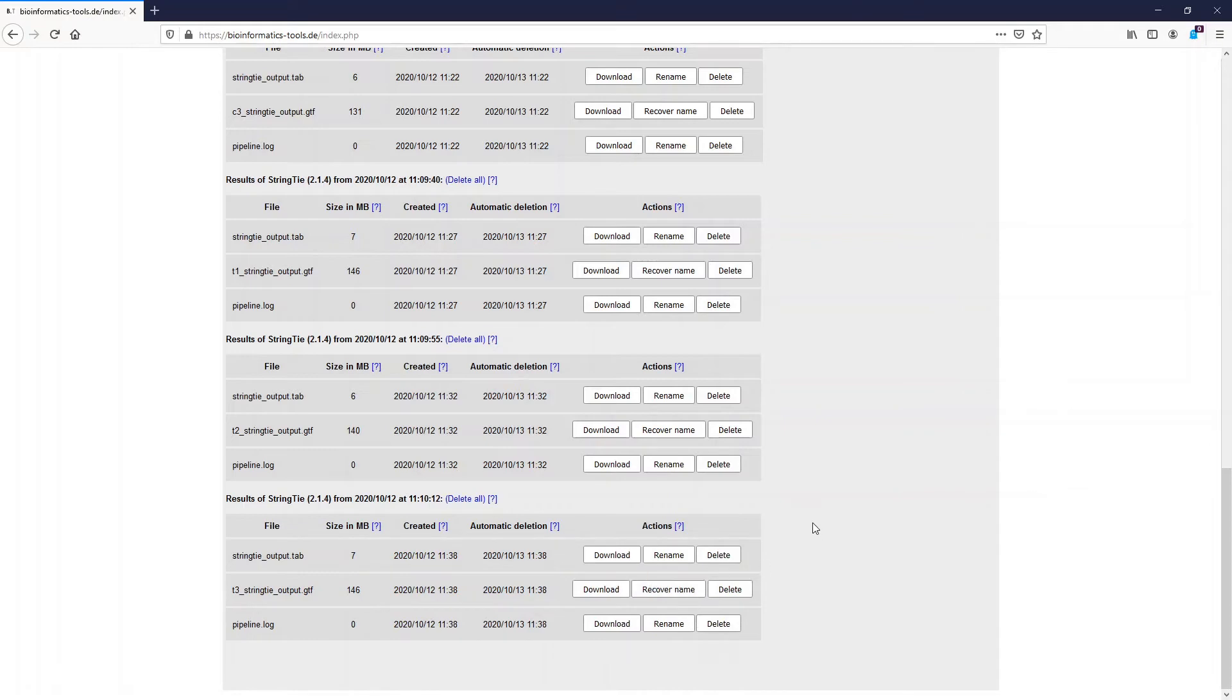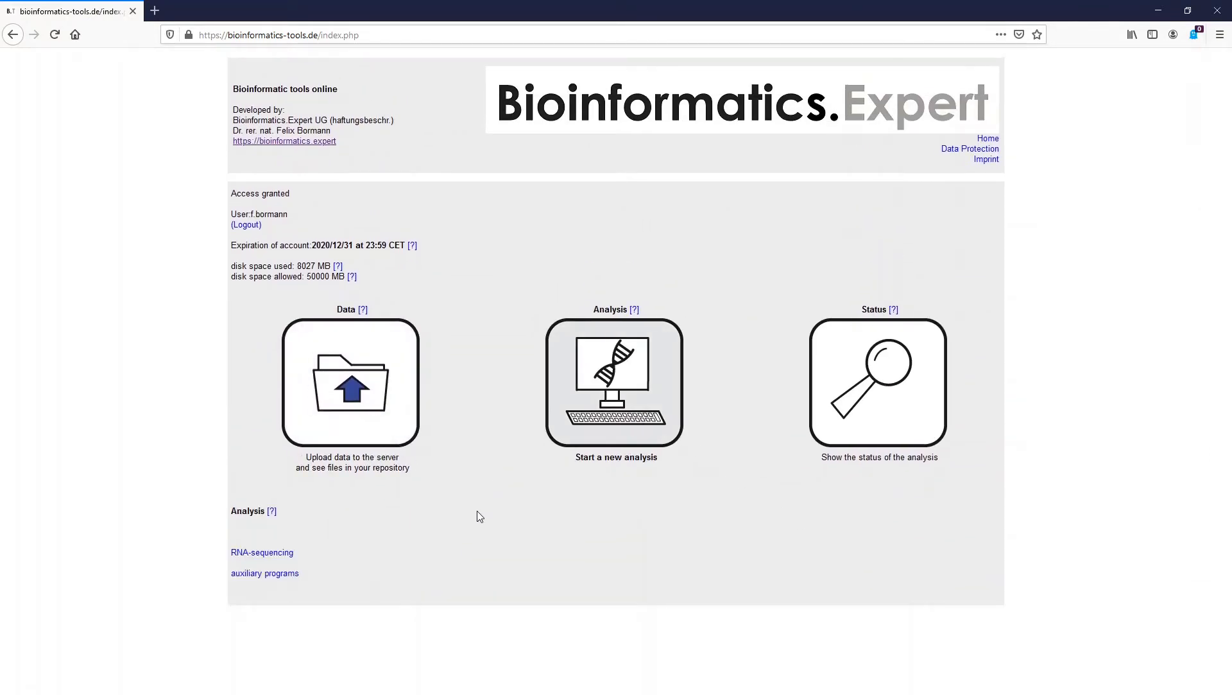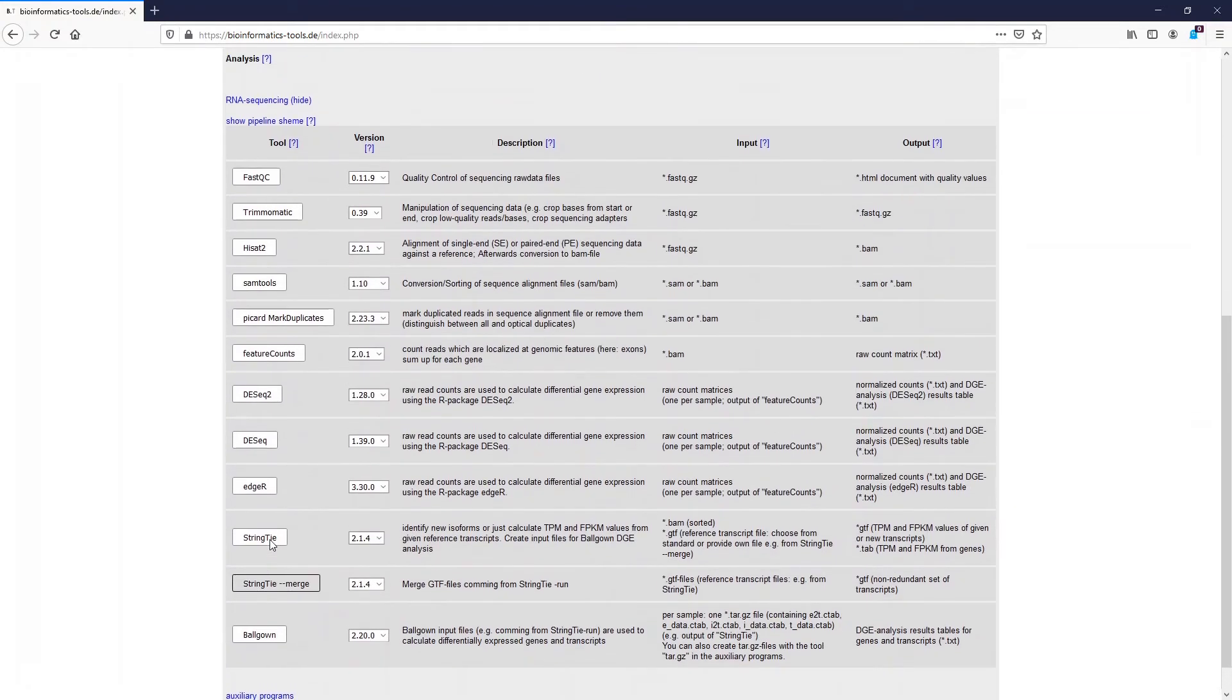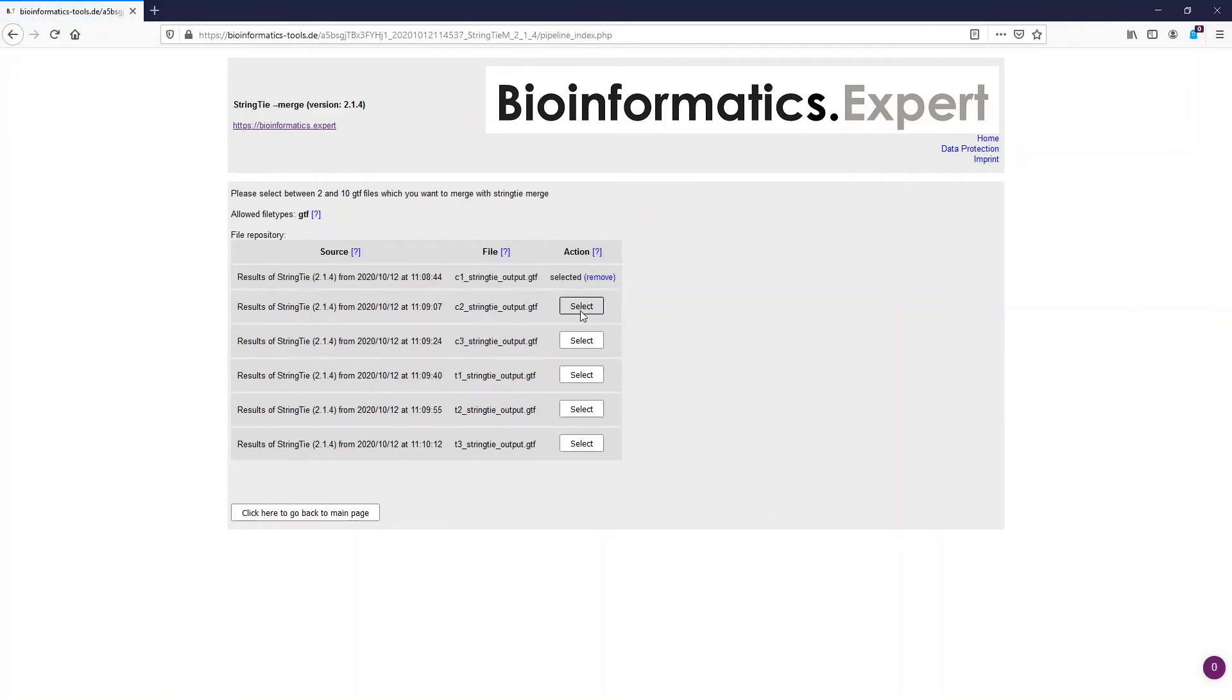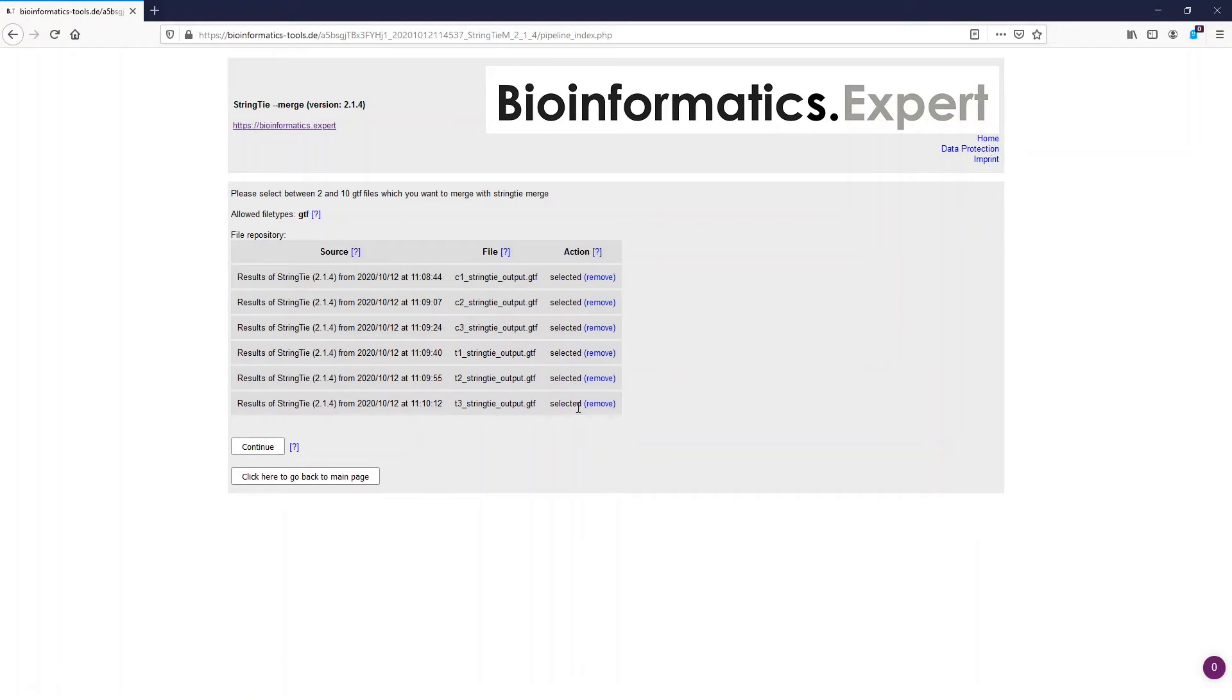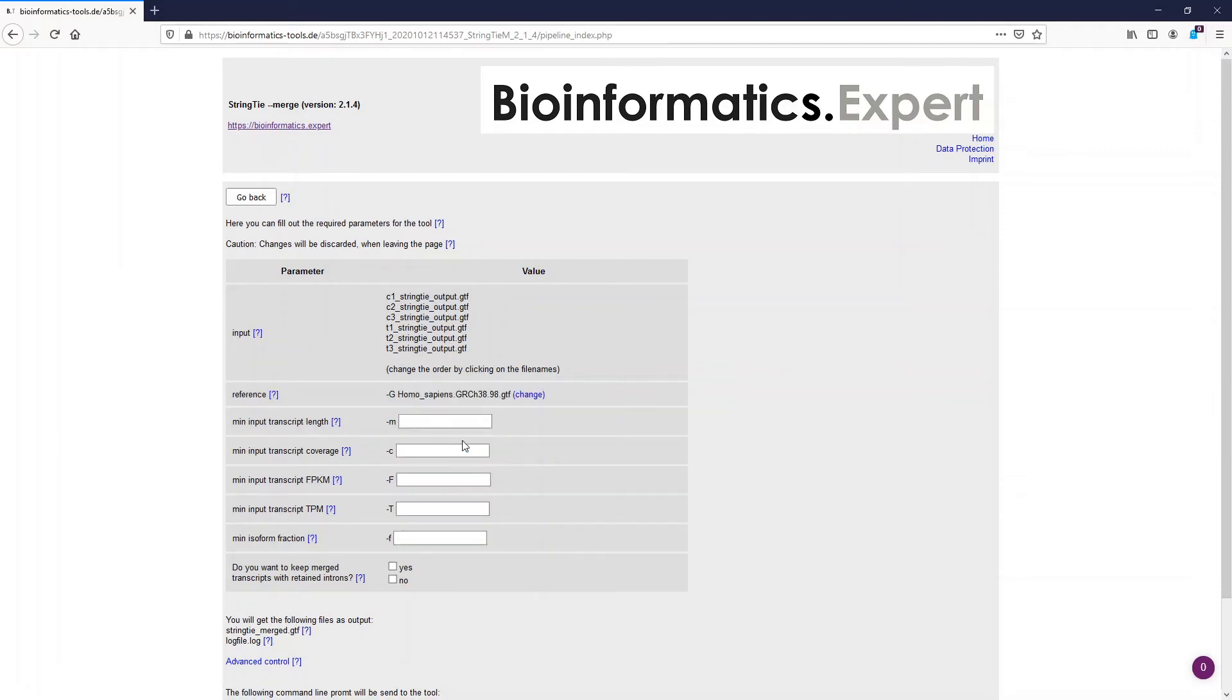After they were renamed we can start StringTie merge easily from the table. We now have to select all the reference files which we want to merge. So let's select all six. Also we should add the human genome reference. However we leave the other parameters as default.